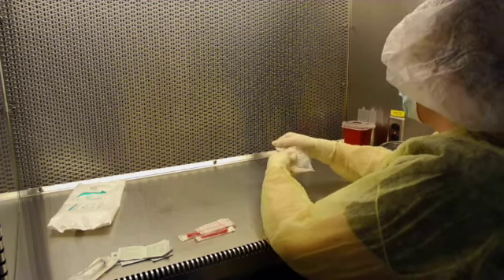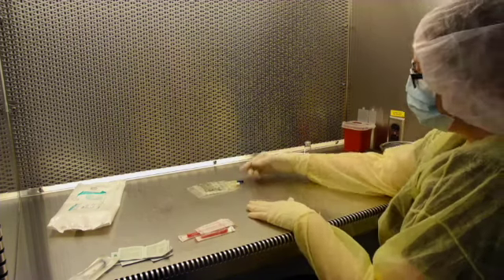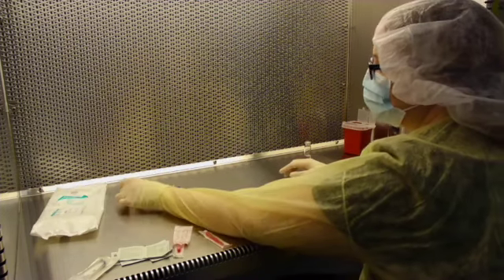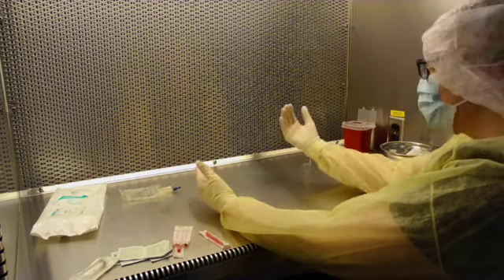Take a look at the IV bag. The injection port must always receive the first air from the HEPA filter. If it was flipped around, the tubing port would be blocking the air reaching the injection port. Again, don't be afraid to spread out so that the area right in front of you is clear for compounding.